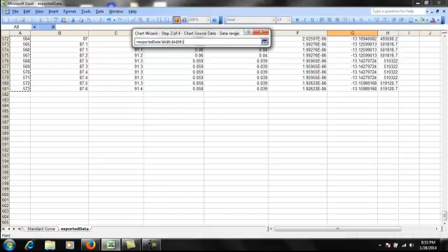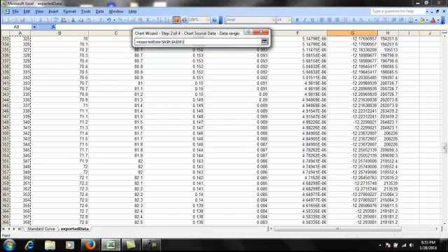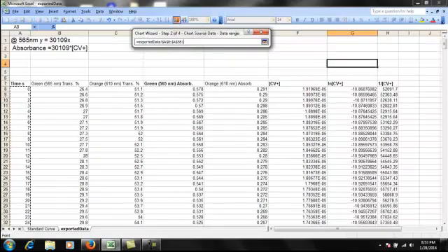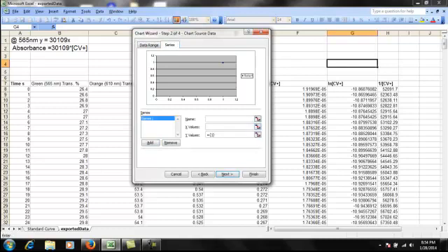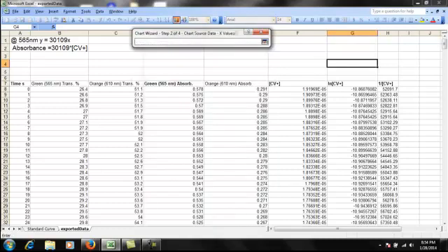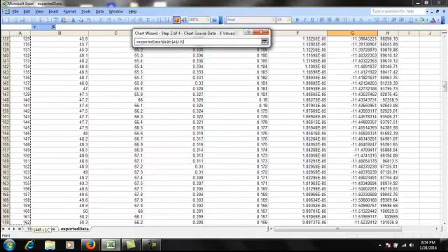Okay. Then I make my Y list this. Nope, I don't want to do that. Nope, not at all. Shoot. Okay. No, maybe I don't want to do that. Okay. Series is in columns. Okay, series. Yeah, that's where we go. Okay, so I want to add. There we go. Sorry about that. Okay, so I'm going to make that my X data.